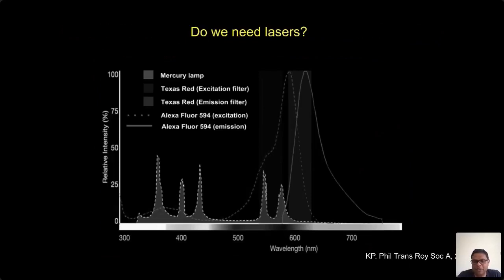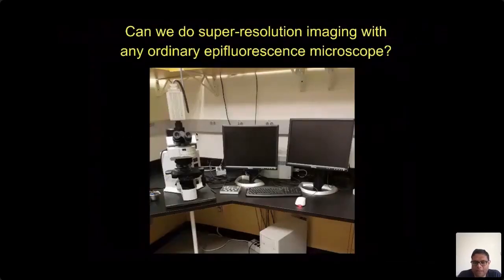So basically what I ended up doing is I took this microscope, I put a rod below, some things to stabilize. I really don't know if it worked. And if you see the setup, there are a lot of small things. I changed the lamp behind, and this is a very old computer. It has 2 GB RAM. So I was working with the bare minimum that you can find in any lab across the world, no matter how poor the lab is, right? And of course, I got a new objective lens. The camera was this 12-bit CCD camera.